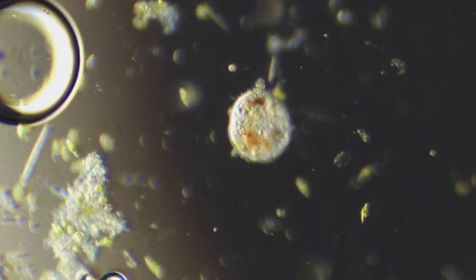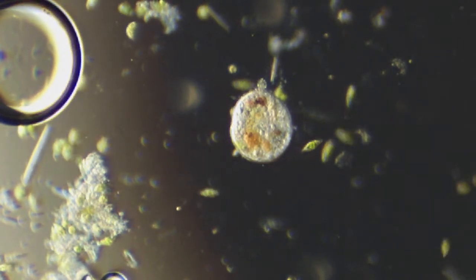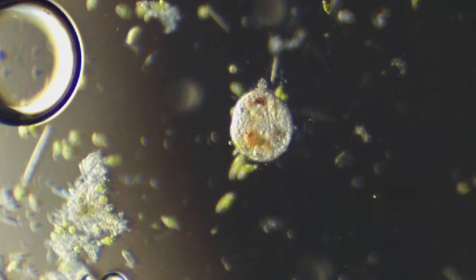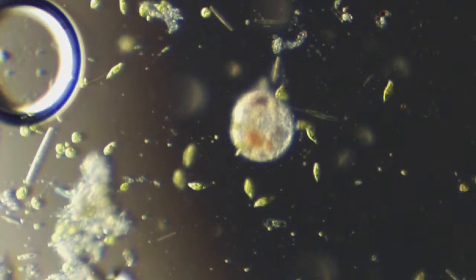A lot of structure. I'm not seeing any cilia beading on it. Certainly has no flagellum of any kind. So it could be a resting structure of something like a cyst or an egg. But man, those Euglena seem to like it. They're really hanging out there.